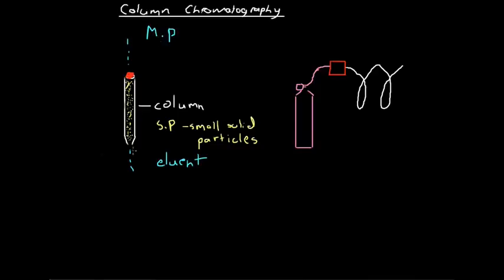In order to form the chromatogram and analyze how long different components in the sample are taking to come out, we pass the eluent through a detector. A UV detector is one that's commonly used. In a UV detector, UV light is shone through the eluent stream onto a detector here.